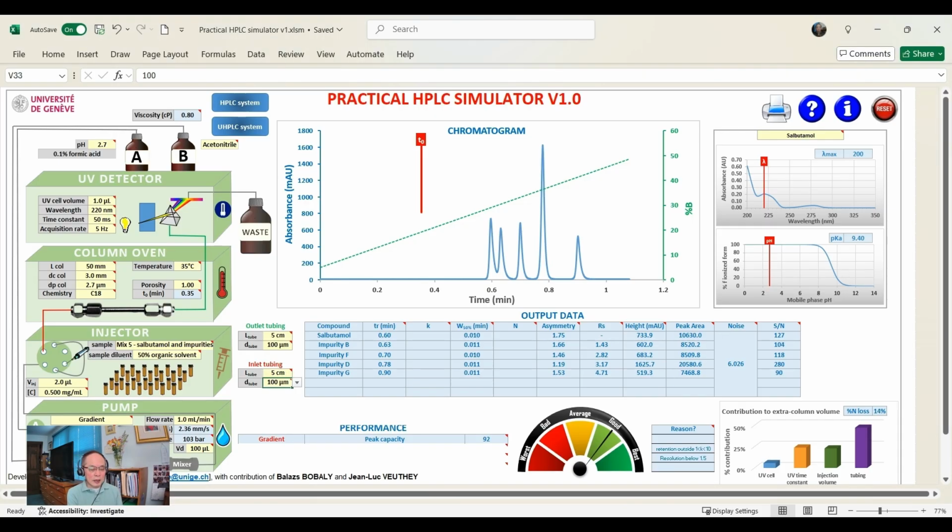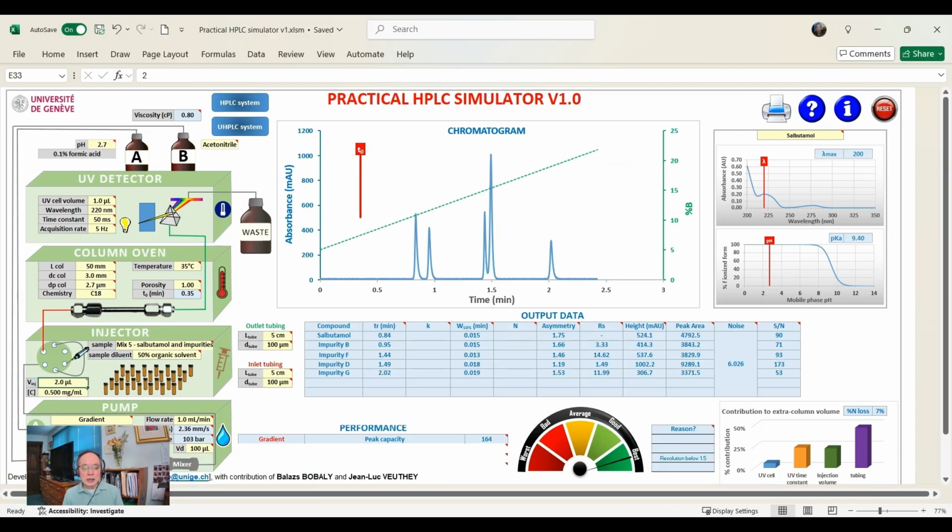And finally, I want to illustrate the effect of gradient time, which is going to be the most dramatic. We understand that a longer gradient time gives you much higher resolution, but also increases your analysis time, right? So let's say we use the same column and go to 10 minutes of gradient time, and one can see the efficiency is much higher. The overall peak capacity is going to be proportional to the square root of the gradient time. You can see things are better, but there is still some coelution because of changes in retention time. Let's go back to 2 minutes.